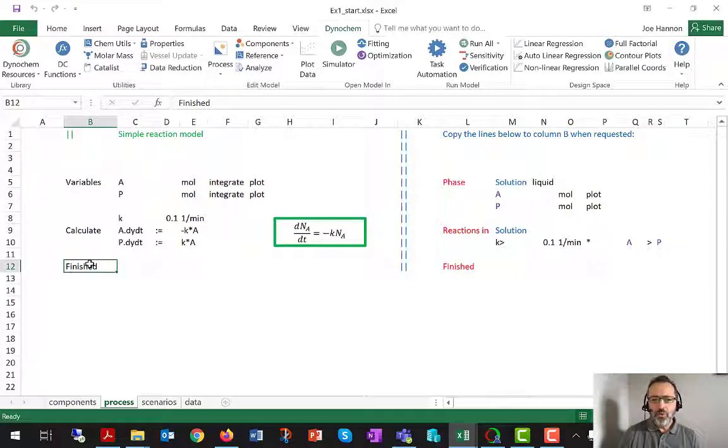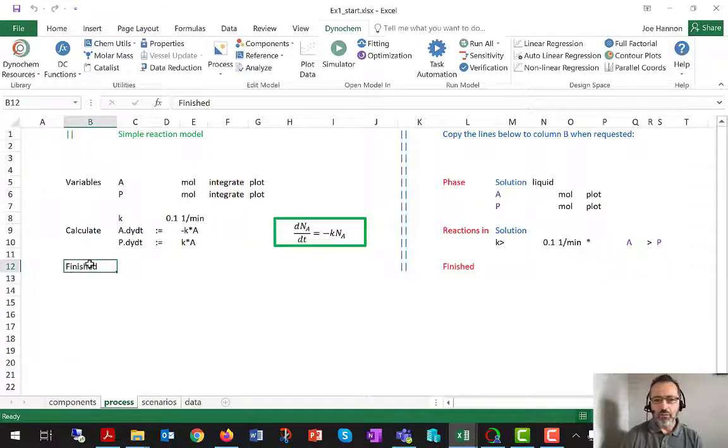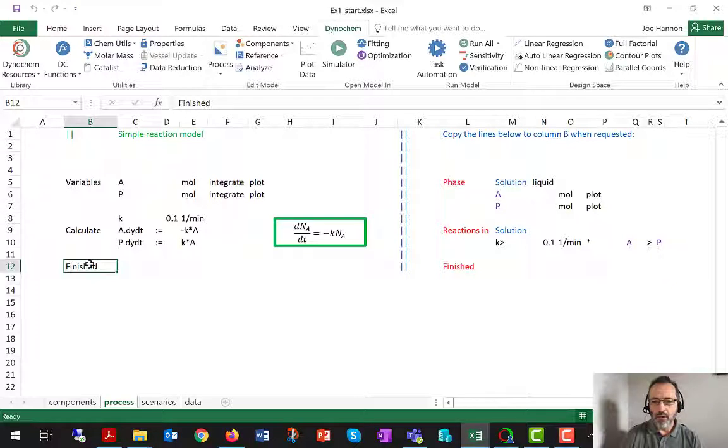So for the most part in this video series, we've been working with pretty much the same model, a fed batch reaction with a heat balance.